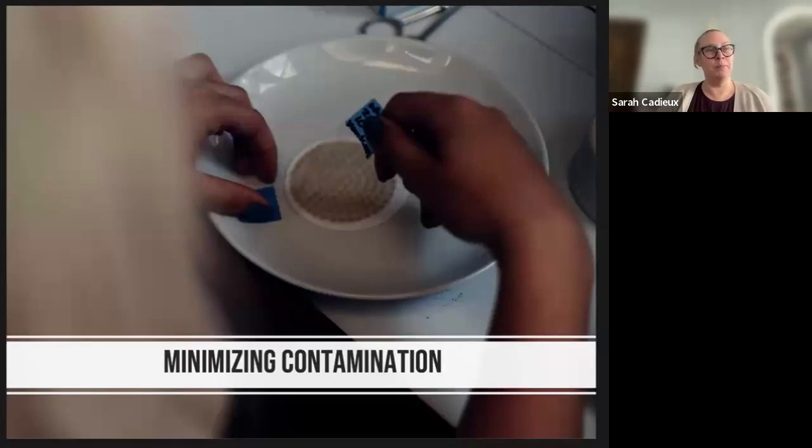And I think that's why having the community science element included within this and including artists really changes what is the end product or the result. Because if plastic is everywhere, is just identifying where it is very meaningful, or is the outreach and the exposure element the most meaningful? And so, being concerned with contamination and talking with people working on microplastics, we are changing protocols again, using this forensic tape onto filtered samples instead of digesting and evaporating water.